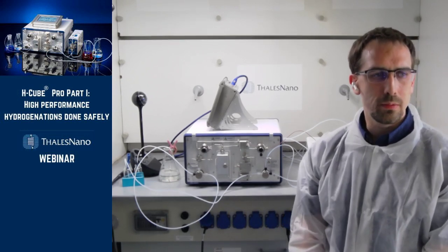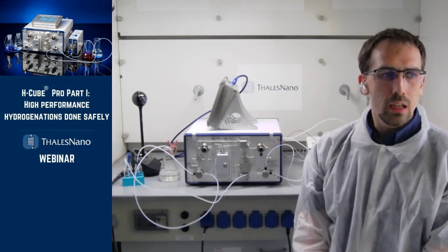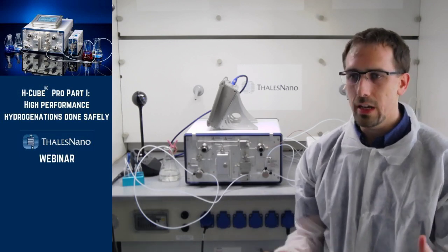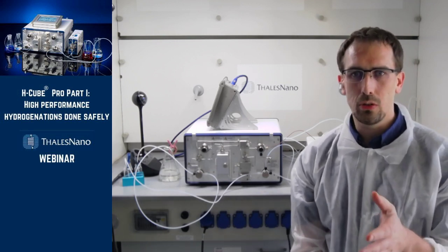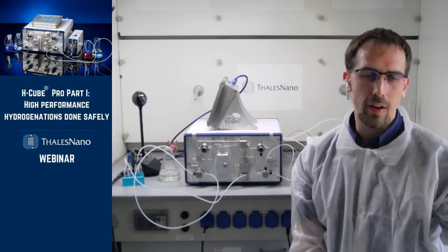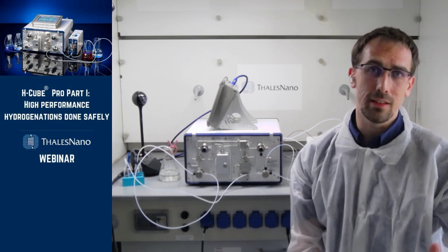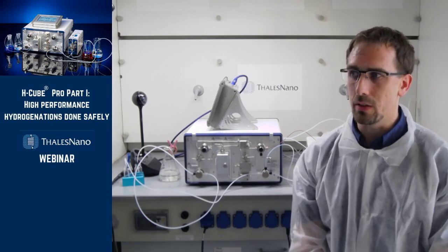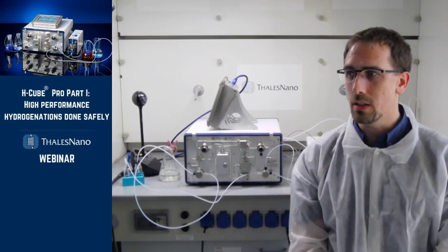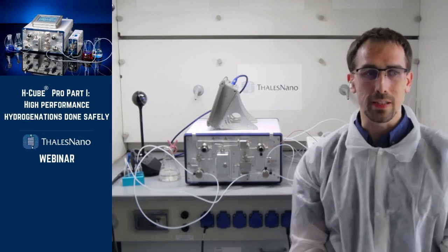What will be the maximum concentration that can be used? So the typical concentration range to work in the H-Cube Pro is going from 0.05 molar to 0.1, 0.2, sometimes even 0.5 molar concentration. The actual concentration will depend on your specific problem.